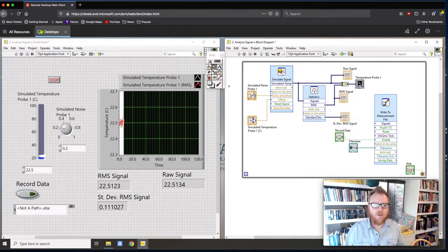So I'm going to wire up from the RMS into the signals, and I also want the standard deviation, so I'm going to wire that up as well. And as soon as I combine that signal, I'm going to get that cool looking flux capacitor thing. Yep, there it is. Which is just taking 2 signals and merging it into 1.